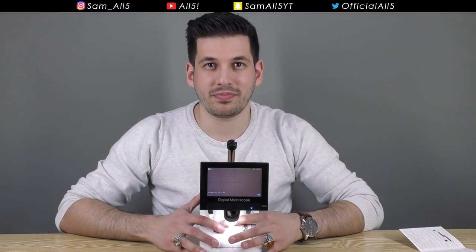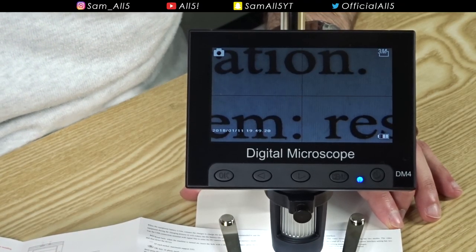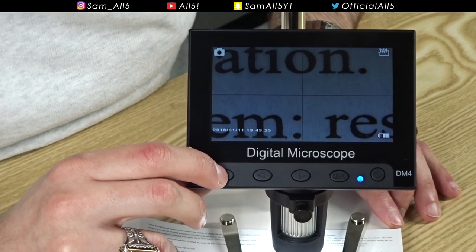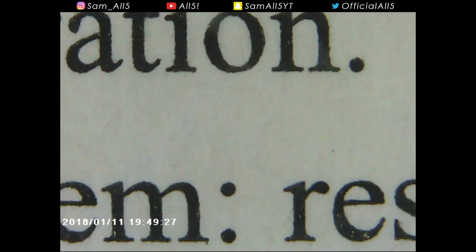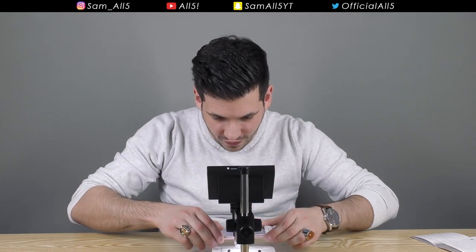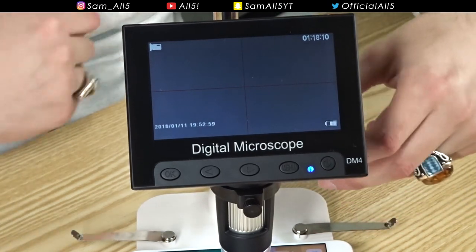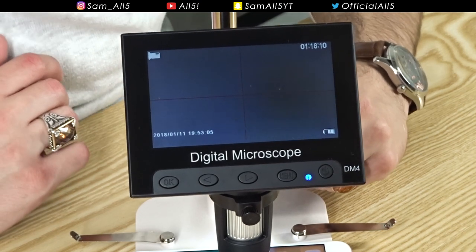Digital microscope — let's see. That is pretty cool, but it's not a thousand times zoom like they claim. Let's take a picture. I'm going to put my phone screen in the microscope to see if you can actually see the pixels. All you do is turn this knob until it becomes clear.